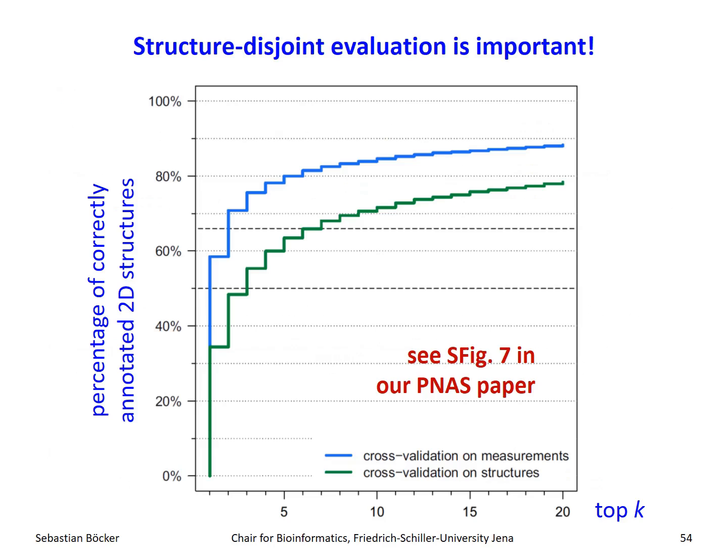And this is again not a theoretical problem. I have shown you these plots before. This time it tells you how often we annotate the correct structure on the first rank of our output list. So these are the absolutely correct identifications or annotations of 2D structures. But then we also report how often we got the correct answer in the top 2, in the top 3, and so on and so on. And with Google, you would look at the first 10 results, for example. So if it's somewhere in the top 10, everything is fine.